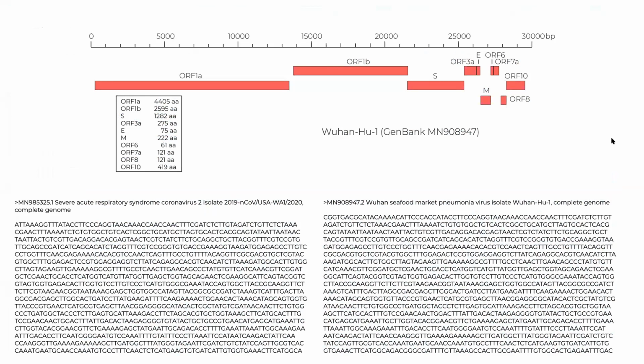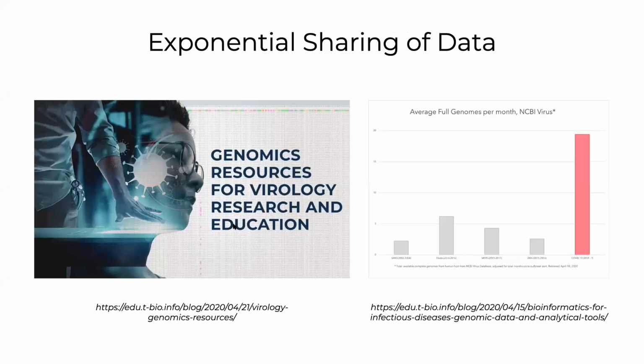Okay, so about in-depth information, like we said, there are a lot of resources that we cover specific to SARS-CoV-2 in this post and specific to virology. There are also general techniques about next generation sequencing and how that sequencing is done, and that will be found in some of the introductory courses, including Introduction to Metagenomics and Metagenomics 1, Transcriptomics 1, Introduction to Genomics. So we have a collection of courses where you can learn more in detail about the sequencing process, alternative technologies, and how this data is generated.